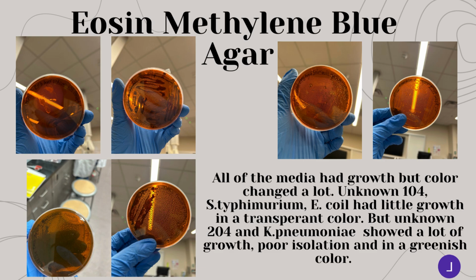On this slide, we will talk about the eosin methylene blue agar, also known as the EMB agar.